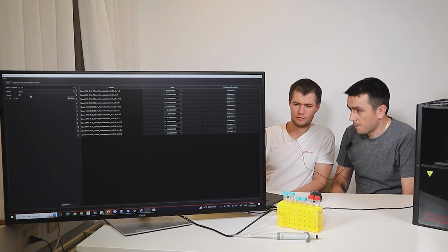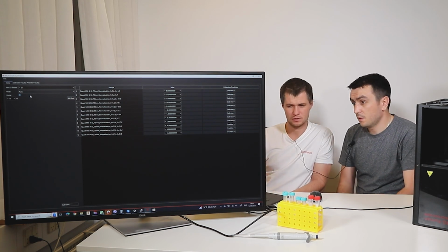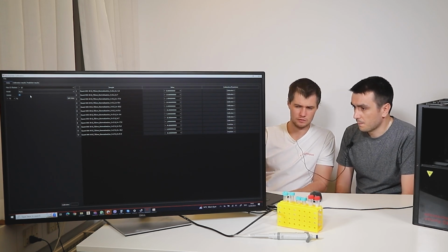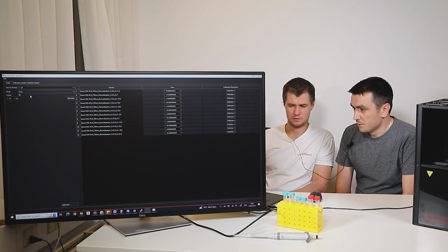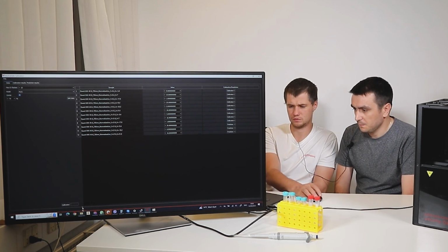And the number of principal components should be as much as possible. As much, because the model will tell us the optimal number we can use in our calibration. But I assume it's not, of course, enough data points for proper calibration. Yes, it's just for showing the general principles of using this calibration.